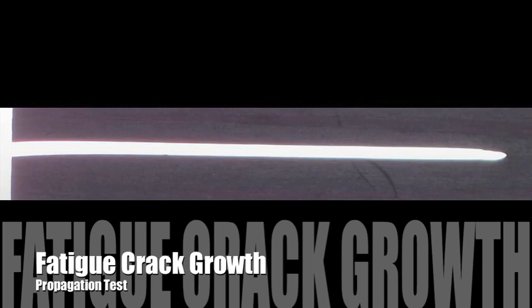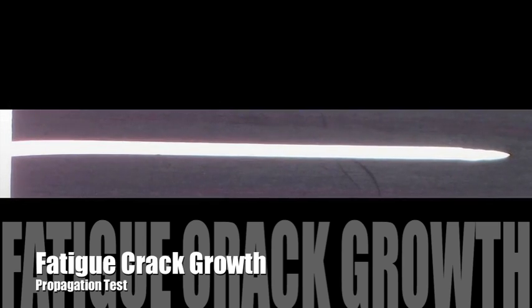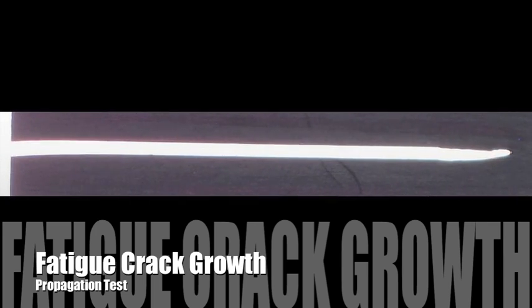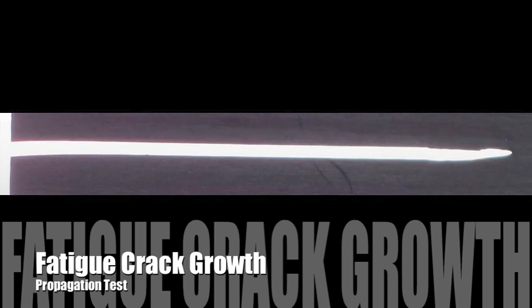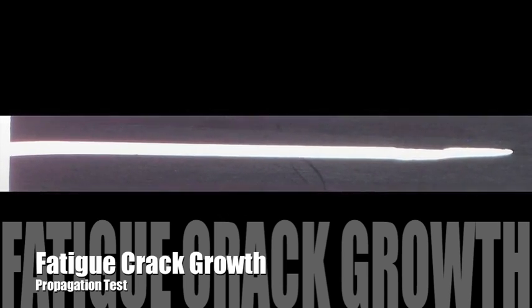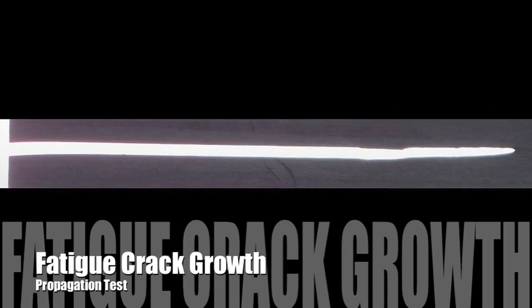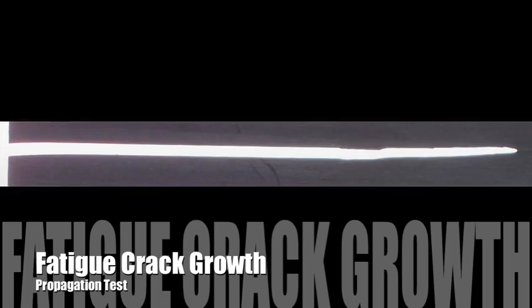For the fatigue crack growth propagation test, we had the program set up so that it would take digital pictures of the crack every 100 cycles throughout the test. We ran strains at 5, 6, 7, 8, and 9%. We ran 10,000 cycles at 5% and 5,000 cycles each at 6 through 9%. This is a time-lapse video showing the propagation of the crack from the beginning of the test toward the end of the test. You can see how it will grow across the screen as the test progresses.